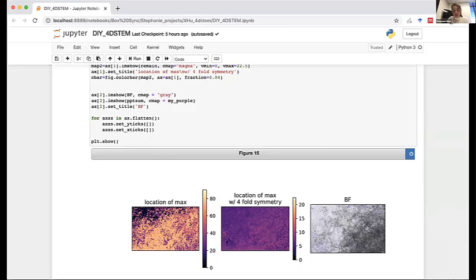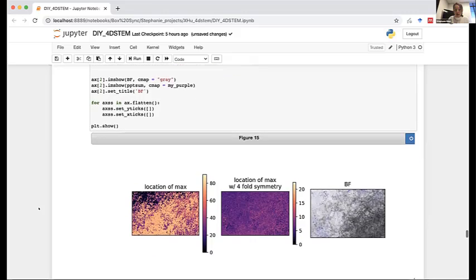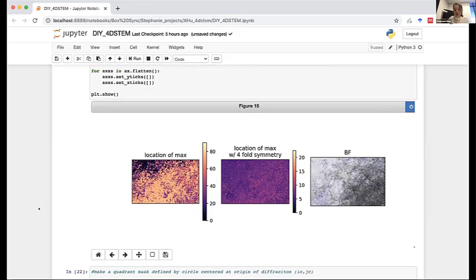And then maybe a few areas where there are outliers, and we can start to ask ourselves, do these areas with rotation, are they lined up where the precipitates are? Is that telling us that the rotation is due to the precipitate and possibly these are areas of high strain? So what we could do with this analysis, if we were to go further and not something for today, is once you start to understand rotation for a sample with a known lattice parameter, you could start to quantitatively assess stress and strain within your system. So this would be a very different technique, but something you built yourself to try and get at some of the information from the cool tools that we saw before that Digital Micrograph has for analyzing strain.